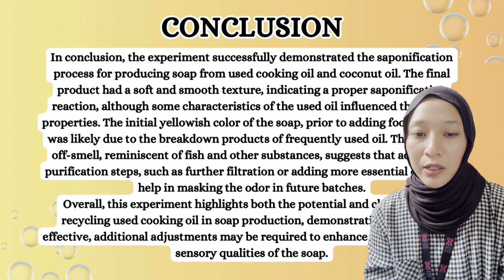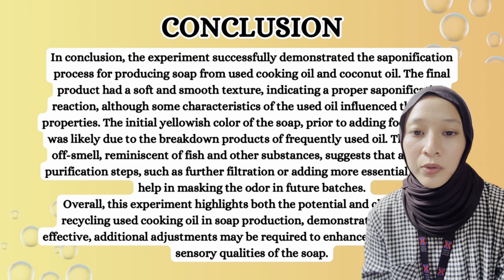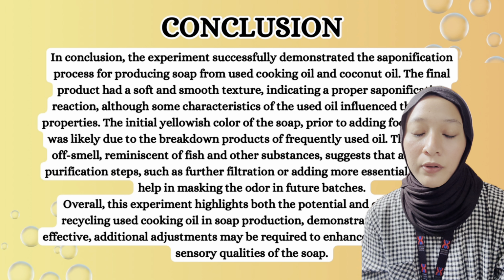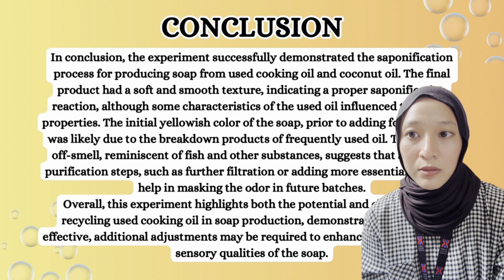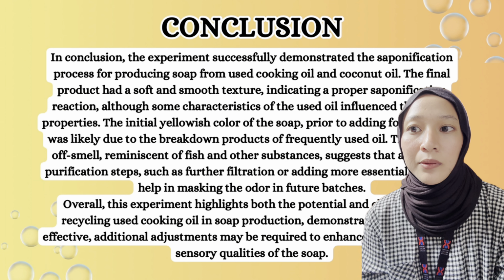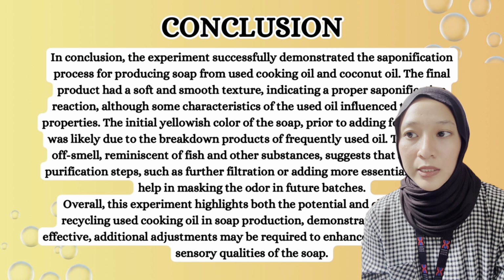So in conclusion, the experiment successfully demonstrated the saponification process for producing soap from used cooking oil and coconut oil, and the final product had a smooth and soft texture, indicating a proper saponification reaction, although some characteristics of the used oil influenced the soap properties.